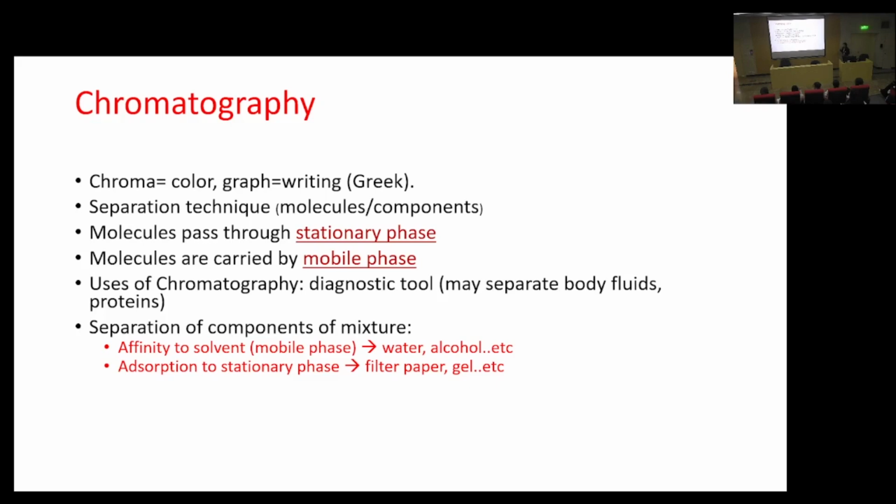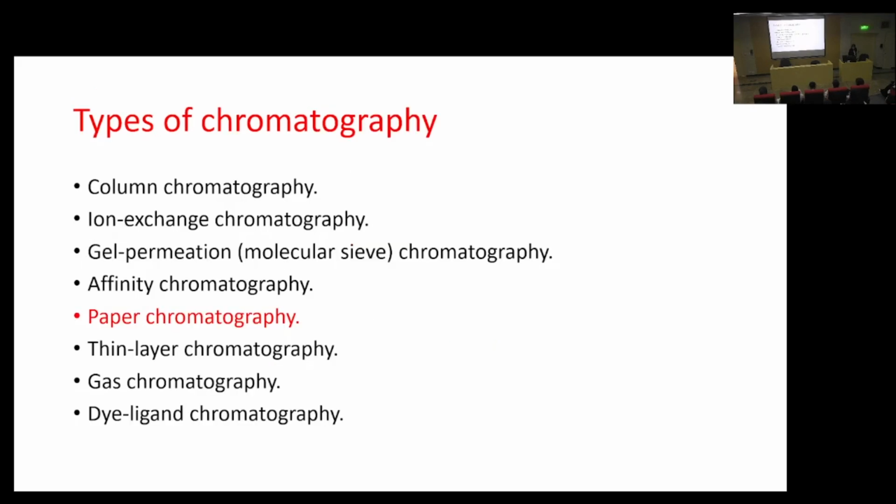All right, so do we know what the stationary phase is? By definition, you need to know, please, what is meant by stationary phase? Mobile phase, what do we mean by it? And those two important determinants of separation: affinity to the mobile phase and adsorption to the stationary phase.